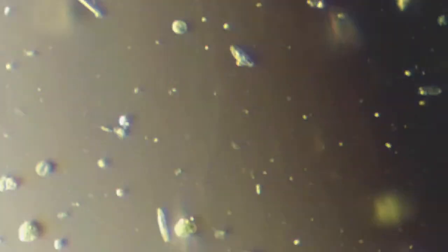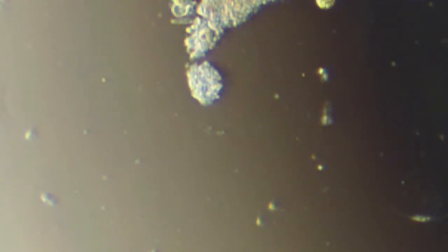All right, let's do a quick scan of the periphery. See what else I'm missing here. Looking for Vorticella. I can find some. Or an amoeba, possibly. Nice. More Euglena just everywhere. Some free swimming Euglena. Sparkling like a little gem. But it keeps moving in and out of focus. You see that kind of wiggle woggle motion? That's the flagellum. Makes them woggle back and forth and rotate. So, dead giveaway. It's not a ciliate. It's definitely a flagellate.